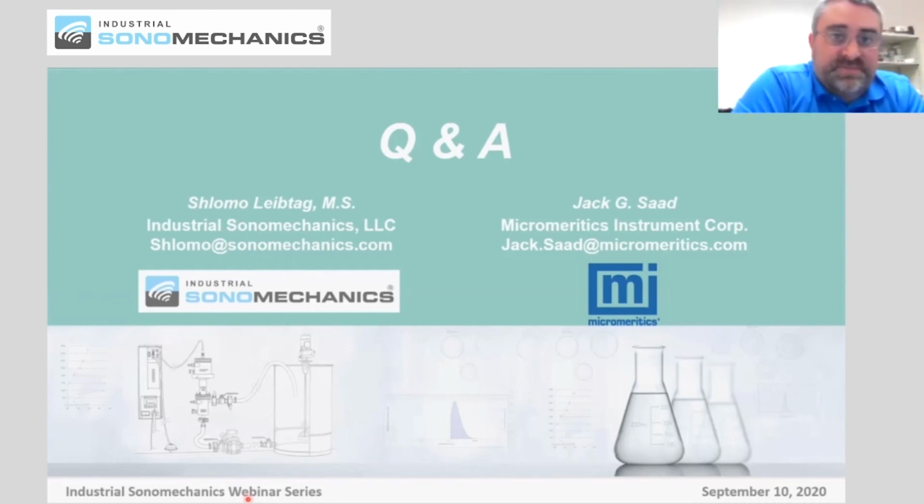So steric repulsion is probably still going to be the best way to keep particles or emulsions separated from each other. With zeta potential, it's important to keep those values in mind. Zeta potential is actually a characteristic of an entire suspension. So it includes whatever's in the liquid, whatever's in the continuous phase, whatever's in the emulsion, whatever's suspended in the emulsion, if it's like some kind of drug or pharmaceutical application.